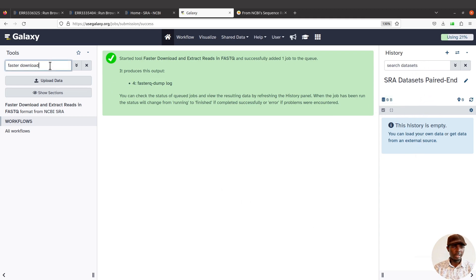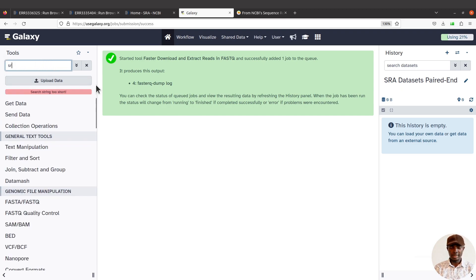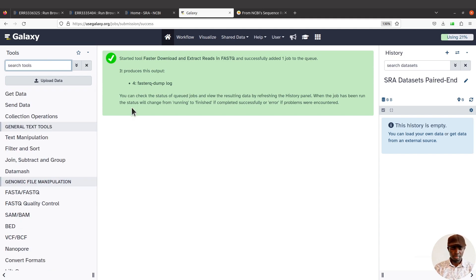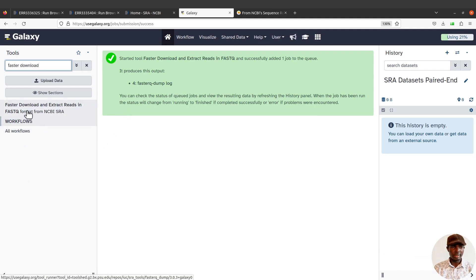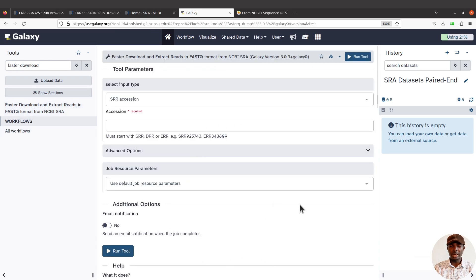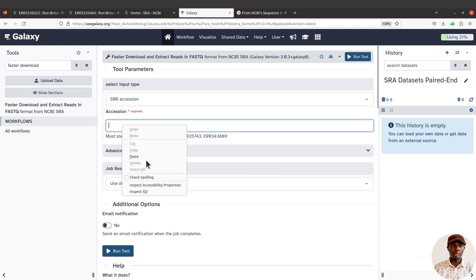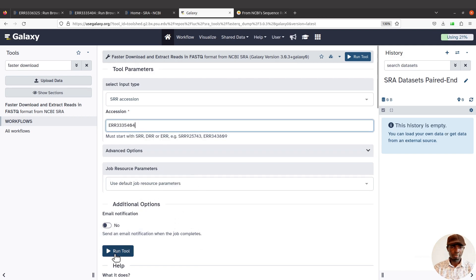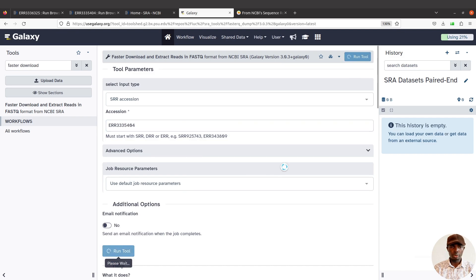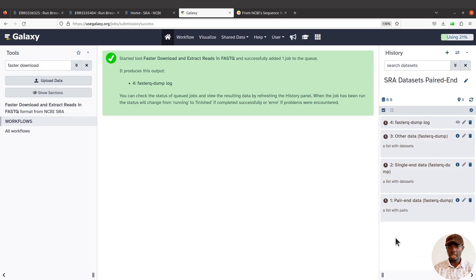We're now in the paired-end history. Come back to the tools panel — the Faster Download tool should still be selected. If not, search for it using 'SRA' or 'faster download' and click to select it. Since we are dealing with a single sample, we use a single accession. Paste the accession ID into the SRR accession field and click 'Run Tool'. Let's wait for everything to be imported.